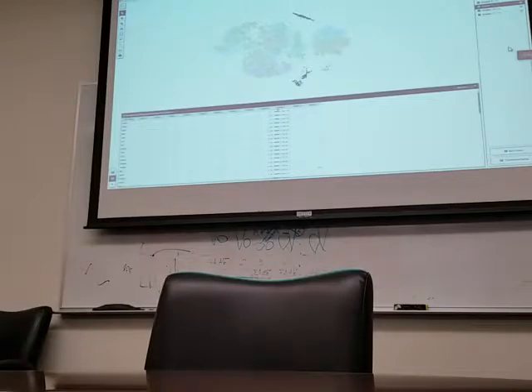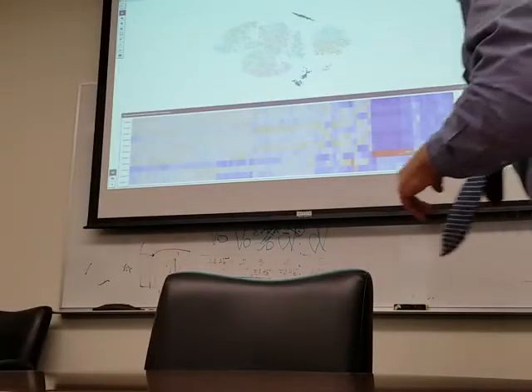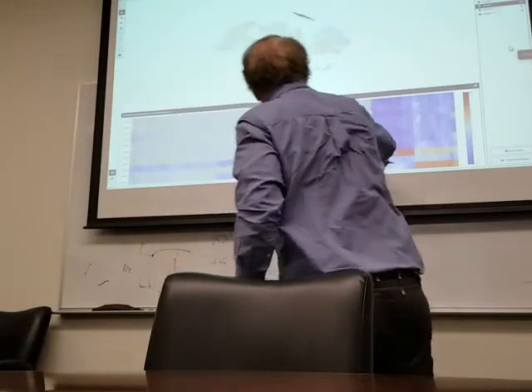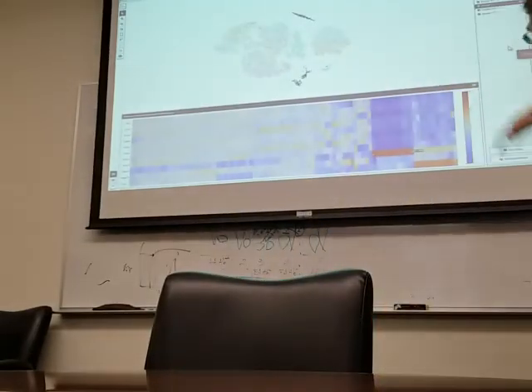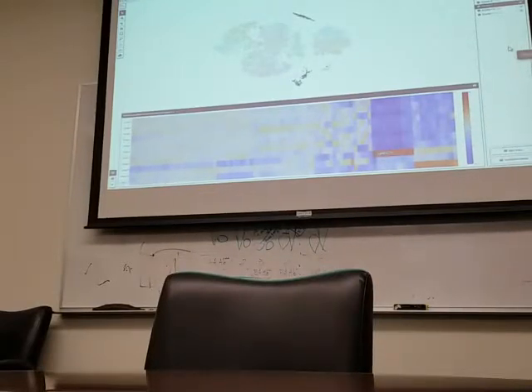The shape of that cluster, I think, is going to be dominated by just a few genes, and I wanted to see if that was actually the case. Can we show the heat map for that one? Because when you're doing this for the RNA data, a few genes are dragging it out to the top there. I think cluster 9 is, oh, here they are, right here at the bottom row. So you're right, these genes are just really highly expressed. I see lysozyme and macrophage genes.